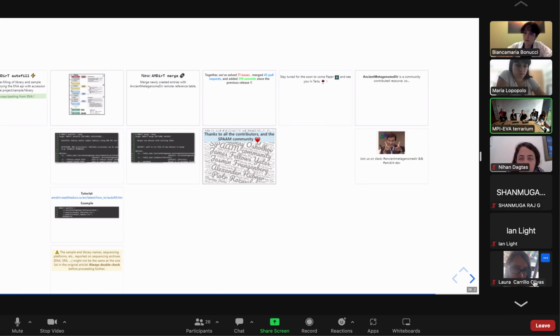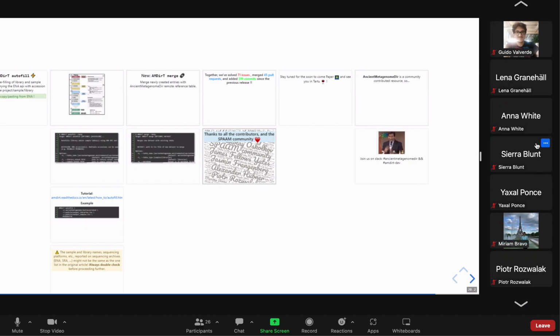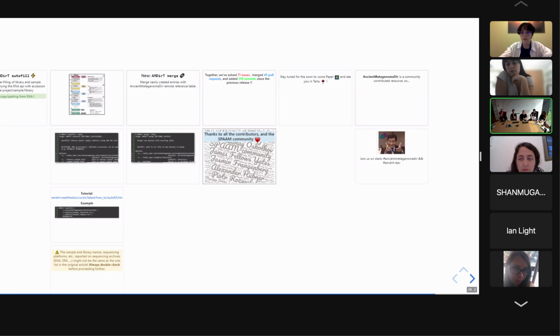And just as a slight extension of the last sentence from Miriam's comment, some of this information can be really, really difficult to retrieve. In one example, which is in the paper, there is a study which cited another study for the library construction. That first study said, we used a protocol from this study. You go to that study, and that actually had an experimental method section where they tested 4 different protocols.